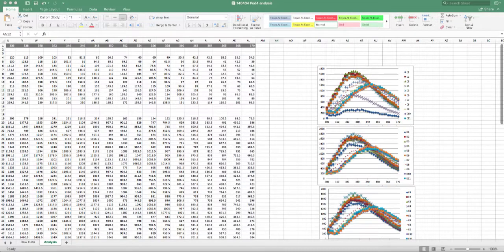The next step is to normalize your data. Normalization will eliminate problems that might arise due to slight variances in pipetting that might cause a difference in protein concentration in your wells. So we're going to use the fluorescence value at 324, if we go back to these curves, so around here, to correspond to the peak in protein that's fully folded.